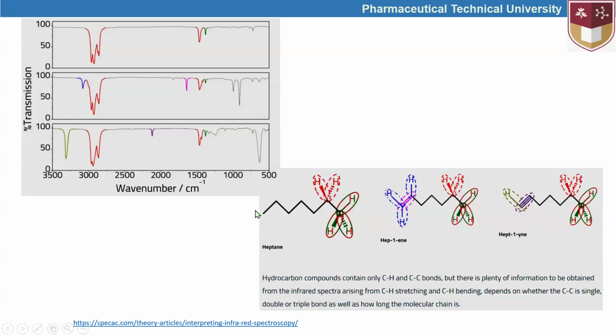Okay, and in the third example, as we witness here, they have similar points as indicated here. Since it does not have the carbon-carbon double bond that exists here, since it has a carbon-carbon triple bond, it is giving absorbance here, not here.